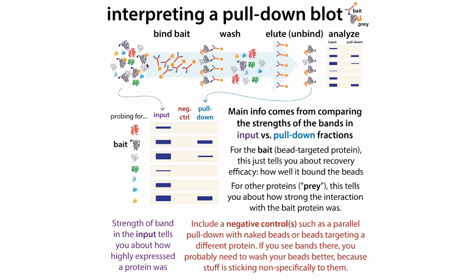So typically you do a few washes, and when you're talking about these washes, basically what you're doing if you're using the magnetic beads is you're just mixing those beads with the liquid, sticking those beads on one of those magnetic racks, sucking off the liquid, and then suspending it in more liquid, putting it back on the beads, sucking off the liquid. And so you do that a few times in order to get the beads ready. And then you'll do that a few times when you're doing the washes.